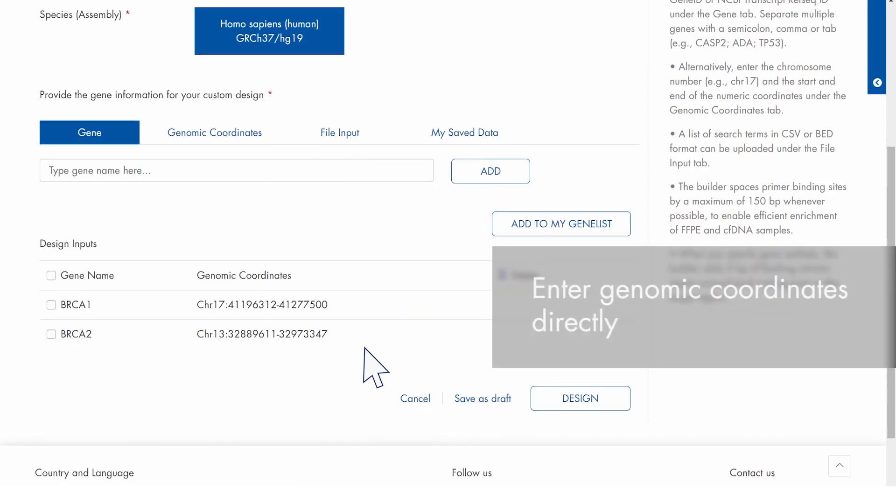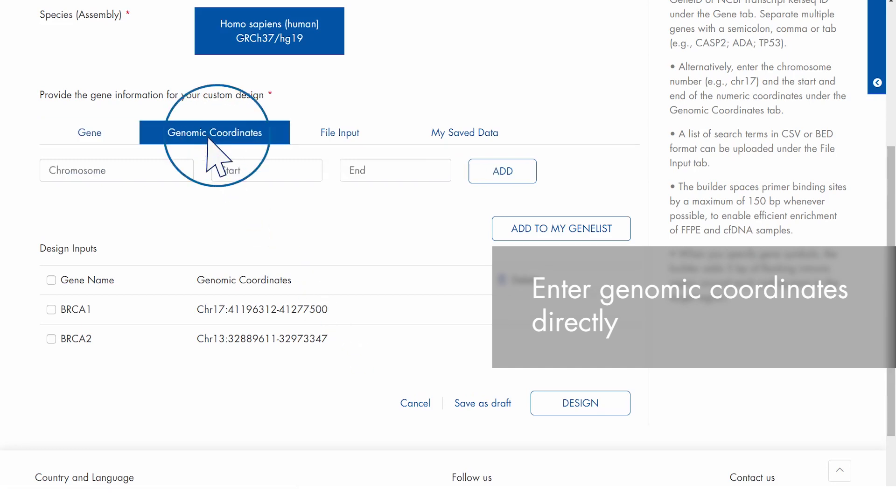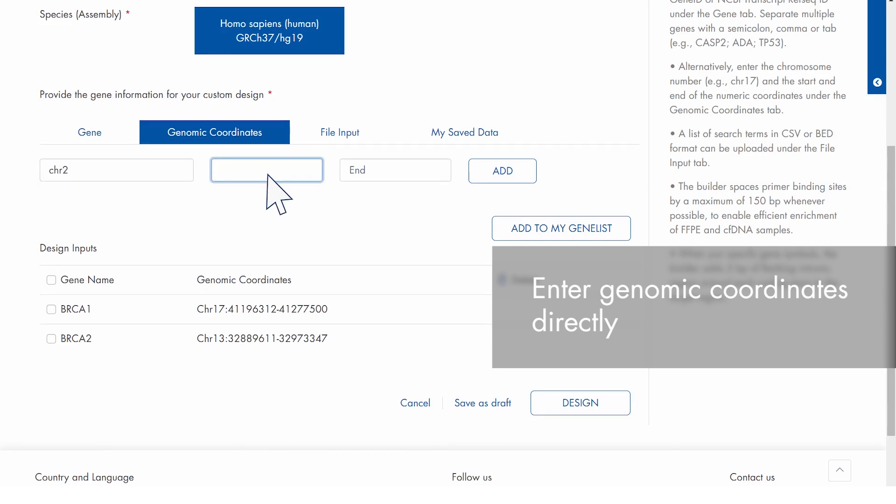To target a genomic hotspot or SNP, click the Genomic Coordinates tab and enter the chromosome number and start and end positions of your region of interest.